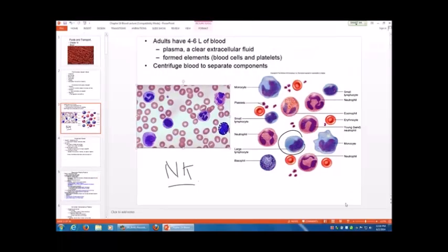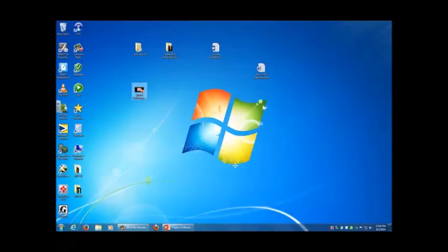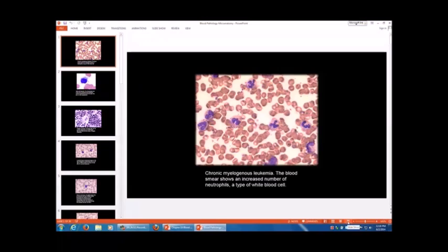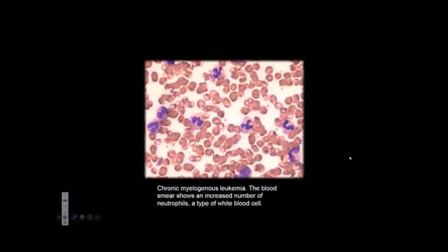Like I said earlier, tomorrow will be just for fun, and this is just fun, I'm not going to hold you to any of this. I got these slides off a web page someplace, and I'm not going to hold you to recognizing any of this. But I do have some pathology slides in my slide box, and I encourage you to look at those as well. So this is just straight pathology.